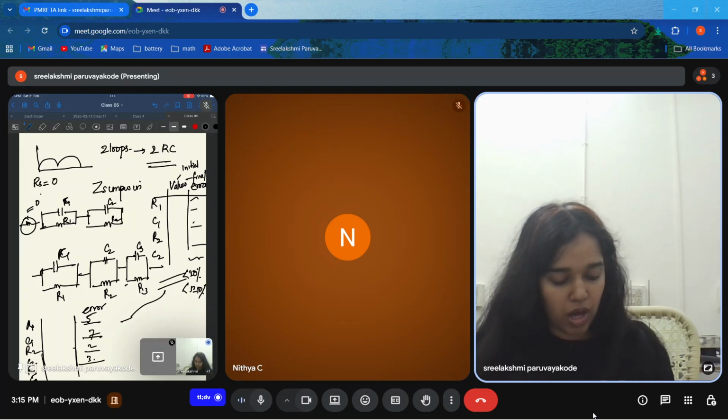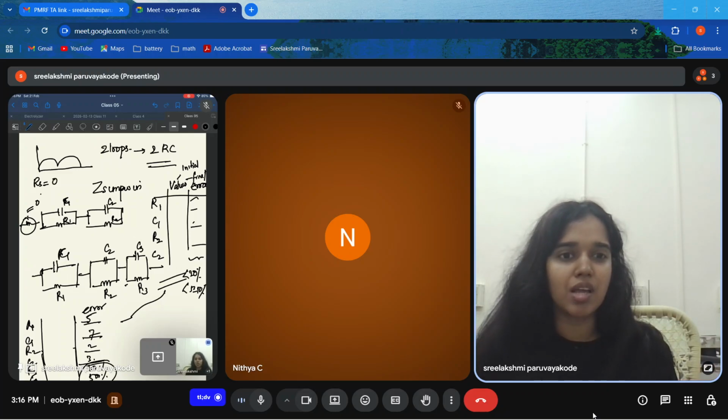Now, sometimes what happens is the R3 value will be 100%. This one will be 500%. This means the error is very high. And in that case, error is high means something above 20. It depends again on the fit. Over time, you'll understand. But something above 100, 200 and all, it's obvious that it means the error is very high.